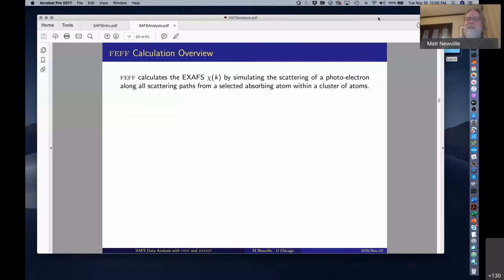There are fit statistics, which were reported for some of the XANES data too. There are information criteria, Bayesian or Akaike, that are also reported. The lowest should be the best, and if they're all consistent, that's good. If they're different, I'm not sure that anyone on the planet knows which one to pick. Probably the information criteria.